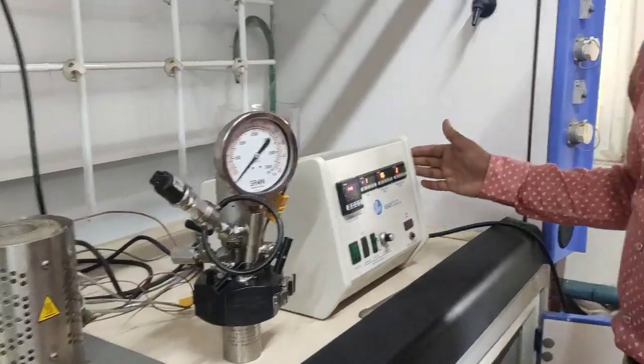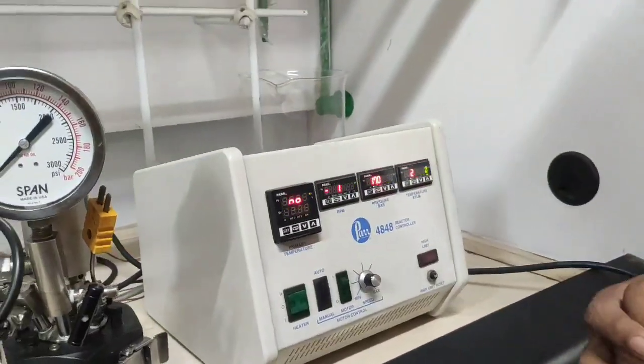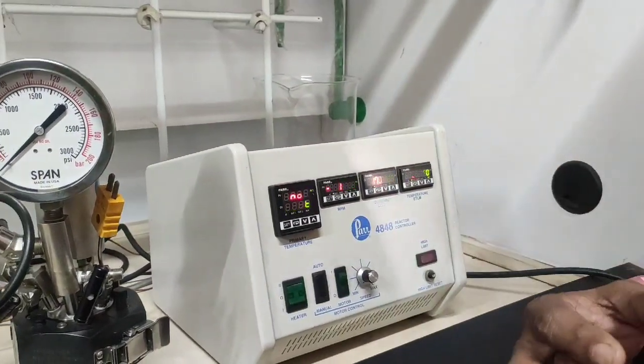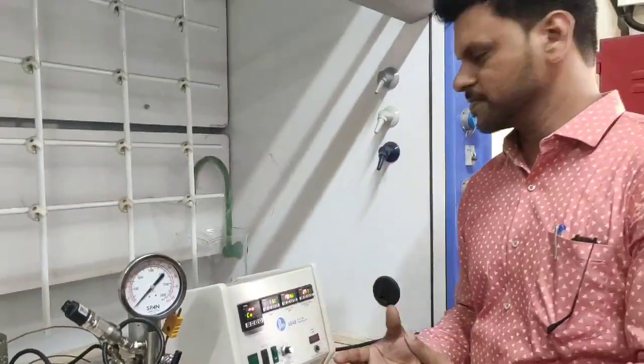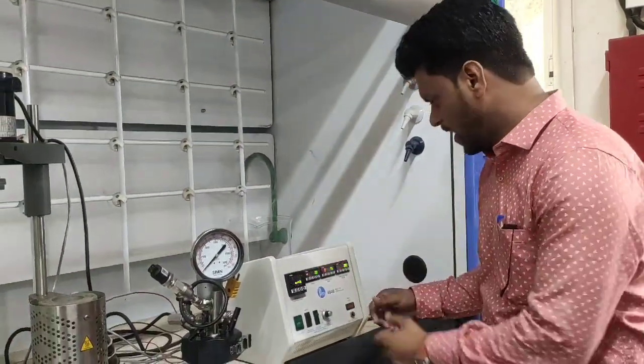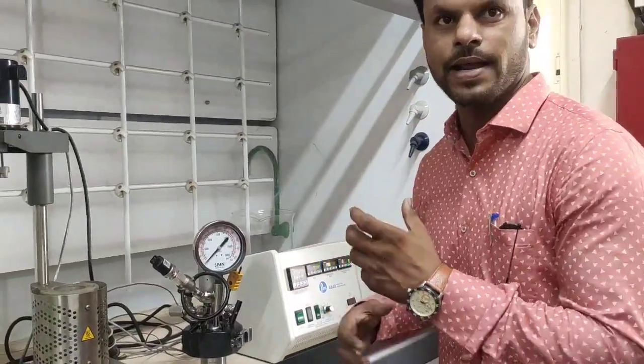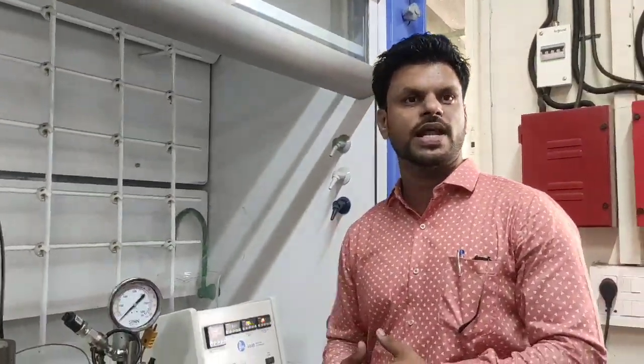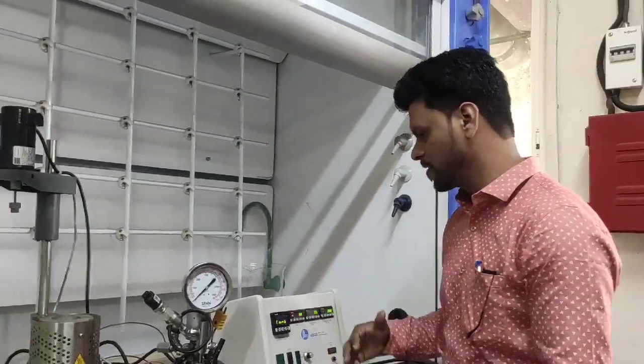And this is called the controller. With the help of the controller, if you wanted to reach the temperature like 200 degree Celsius, I can give the command to the controller and we can also fix the ramping rate. With the ramping rate it will reach the desired temperature.